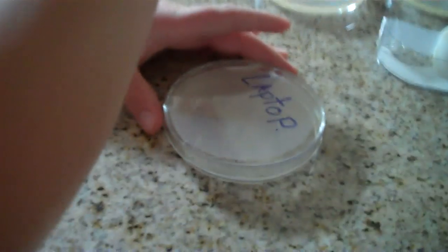If you have five surfaces — this is day four of my experiment. It said three to seven days and I'm checking on it on the fourth day. First one up is the TV remote. Not very many germs — just one or two.